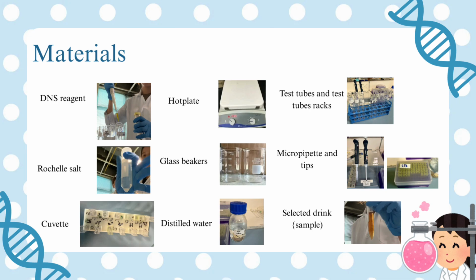Micropipette and tips used to accurately measure and transfer precise small volumes of liquid. Selected drink sample, the substance being analyzed to determine its sugar content.